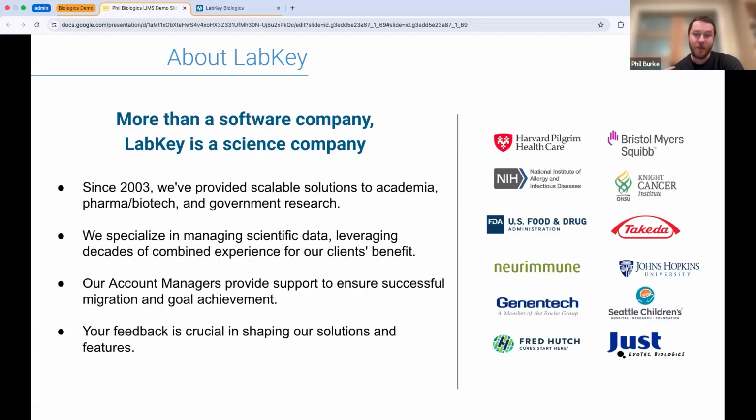Our support team, so account managers like myself, exist to ensure that the data migrations of customers and onboardings are successful. And we really take a lot of the feedback and guidance that we receive from organizations like yours to shape the features that we deliver. That is actually why we created the Biologics LIMS product. We were hearing over and over again that there were some real issues that groups were facing within the scientific community that didn't have good solutions.